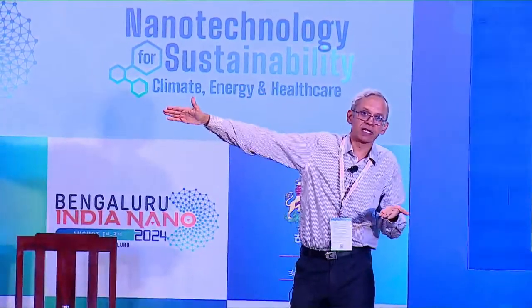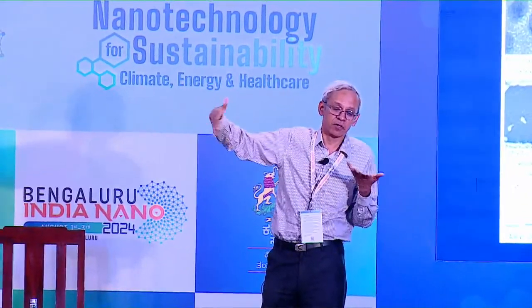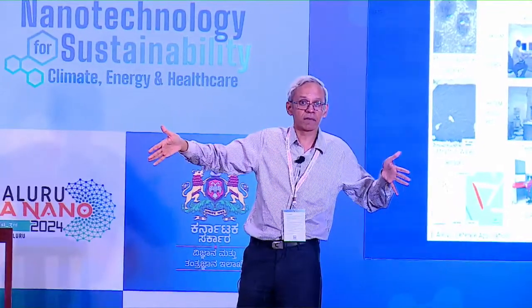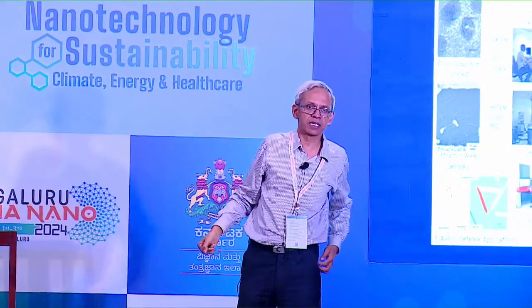You want to make them thin. Laterally, there's no serious limitation. If you want to prepare a specimen, even microns we can actually see. There's no specific limitation on the number of layers that you can see. It can be even several tens, several hundreds even, depending upon what the lateral dimensions are. Even 10 microns, if you're able to get a uniformly thin specimen, we are able to see it.